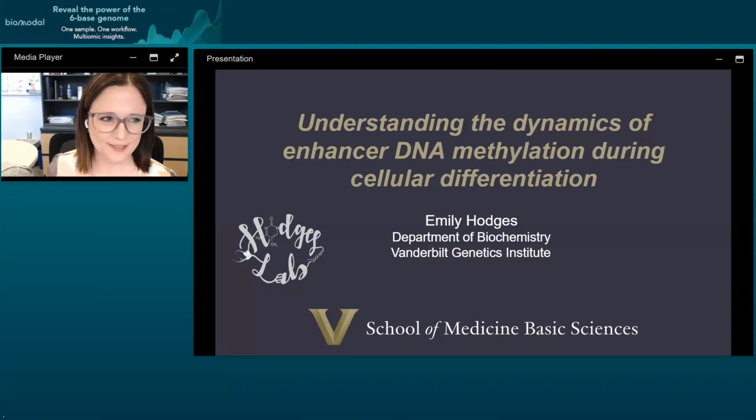Okay, thank you very much. I'm excited to be here to tell you a little bit about our work and also to tell you about how some of our recent work actually led us to want to do 6-base sequencing to differentiate between methylcytosine and hydroxymethylcytosine at gene enhancers during cellular differentiation.